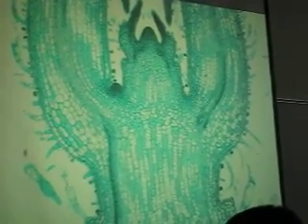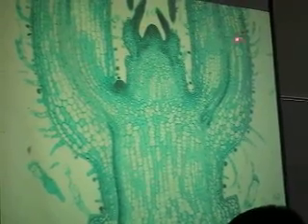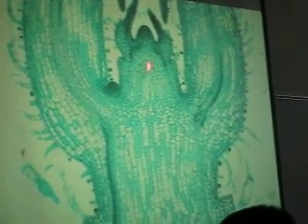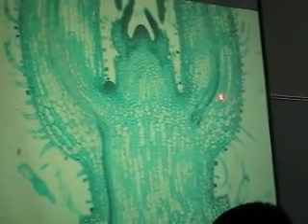Number 6, the coleus stem. Also in your book, we got leaves, we got axillary buds, and there's no stem cap. There's a stem tip meristem. Any dark lines you see would be what? Procambium. The hairs here are technically called trichomes, not hairs.